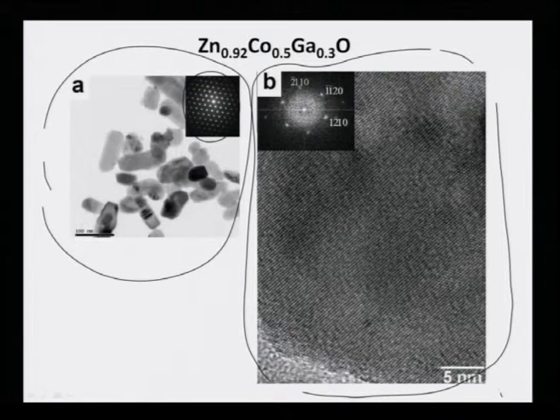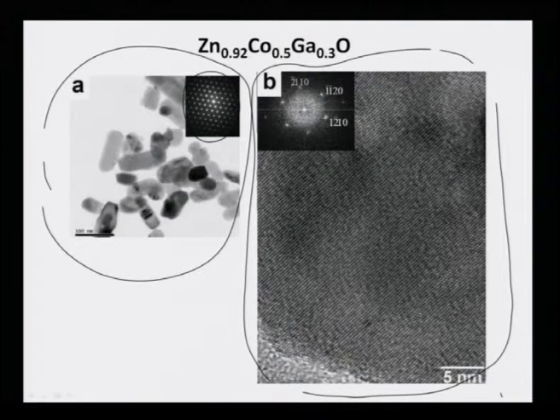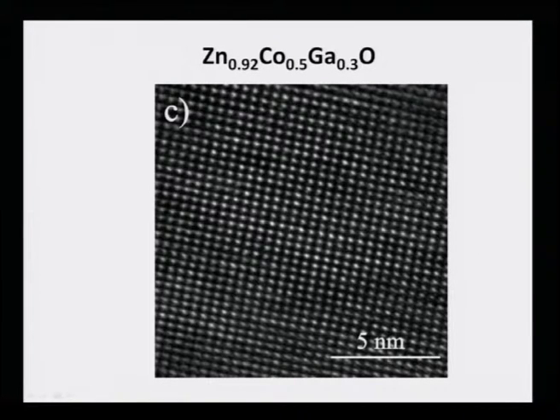The next one is a picture of the same crystal shown as bright dots. In the last picture you saw the lattice fringes, that is, the different lines showing the columns of atoms. Here you can see white and black dots as the signature of columns of atoms. We do not know which atoms stand for which particular element, but we can clearly see the atoms very nicely.